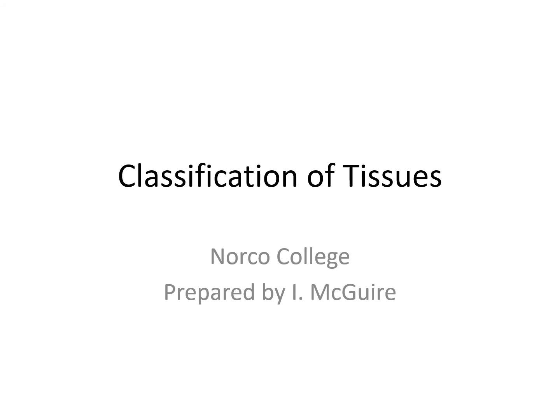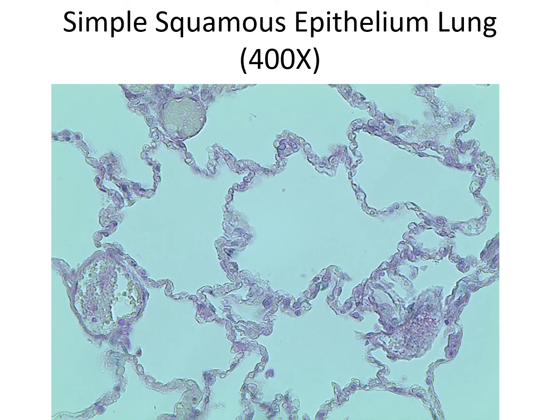Hello everybody! In this video lecture, we will cover histology slides of different tissue types. And so we will pretty much have lots of pictures over here, and same or similar pictures will be used for your second lab exam.